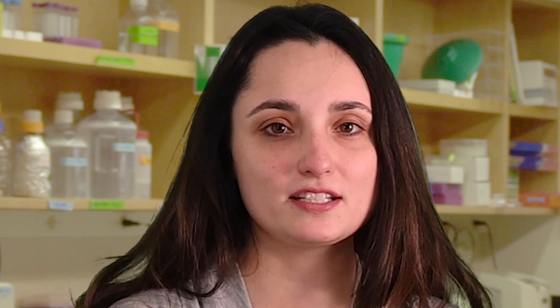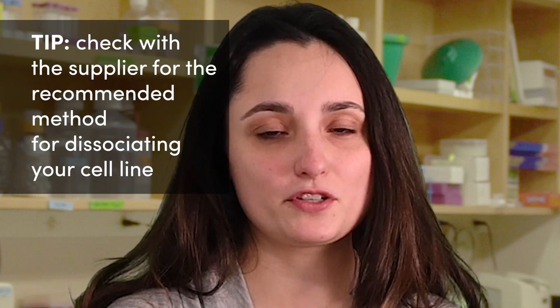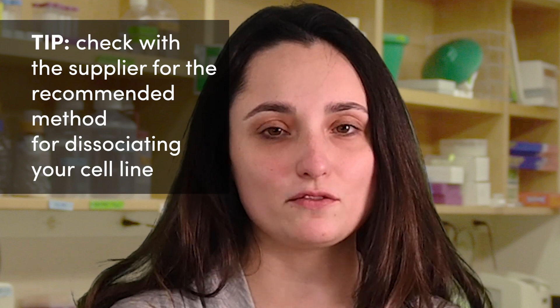There are a few methods to do this. Some cell lines, such as MCF10A and RO264.7, need to be physically detached using a cell scraper. This should be done gently using good sterile technique. On the other hand, some lightly adherent cell lines, such as epithelial cells, can be dissociated using EDTA, which disrupts integrins. Most adherent cell lines are more strongly adherent and need to be enzymatically dissociated using the protease trypsin, which we will demonstrate next. Trypsin and EDTA are sometimes used together, and there are other alternative methods for dissociation as well. We recommend that you check with the supplier of your cell line to find the recommended method for dissociating cells.